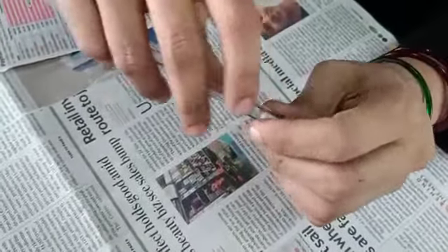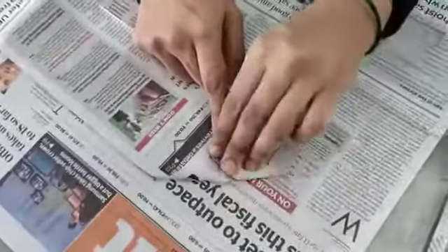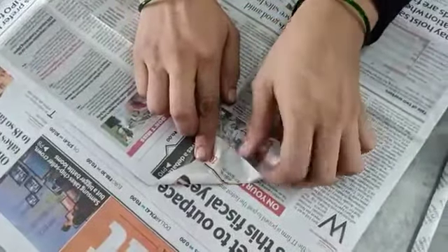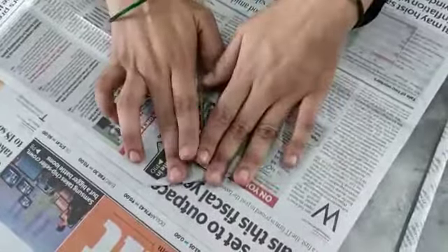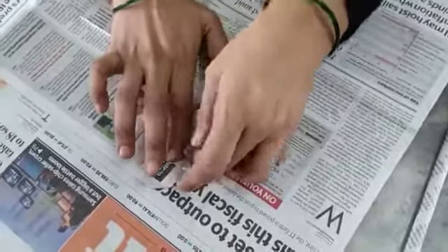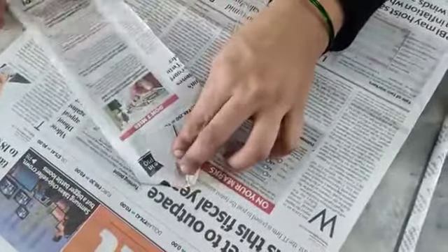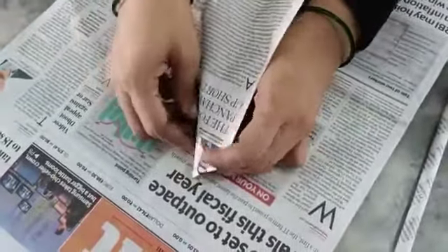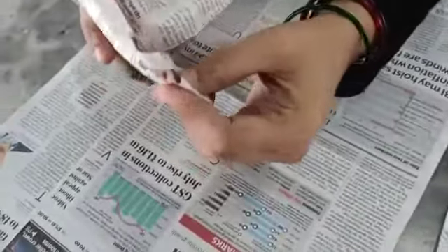Approximately one centimeter should go inside. The initial step is very important — Sakshi, pay attention. Initial stage is very important. Fold it here, this side, and thereafter start covering it like this.